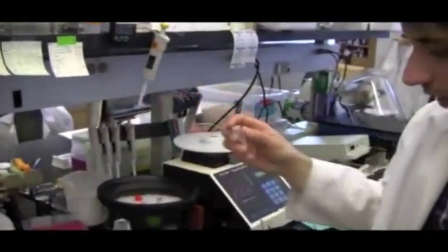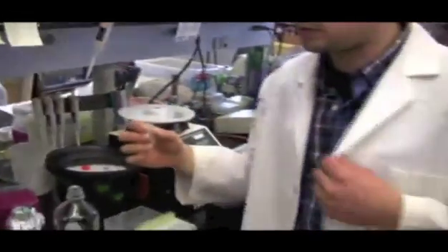So, again, the Arabidopsis genome has DNA that codes for about 20,000 different genes on top of DNA that does a whole lot of other things. But again, we're only interested in the tiny bit of DNA that tells the cell how to make my protein. And so we need to make copies of just that tiny little piece of DNA. And so we have our template, what we're going to start with, and next we want to make a bunch of copies of that. So kind of picture a copy machine.